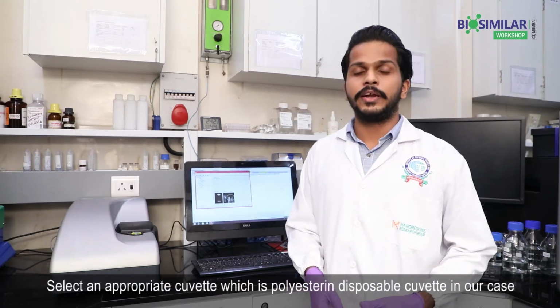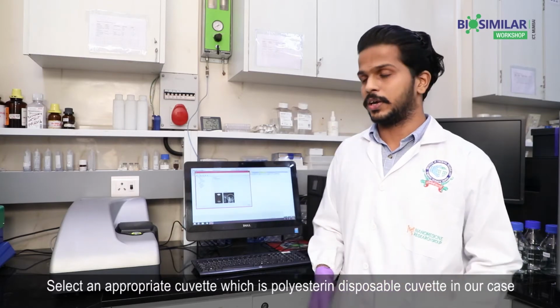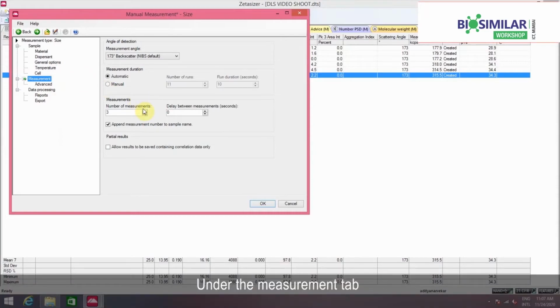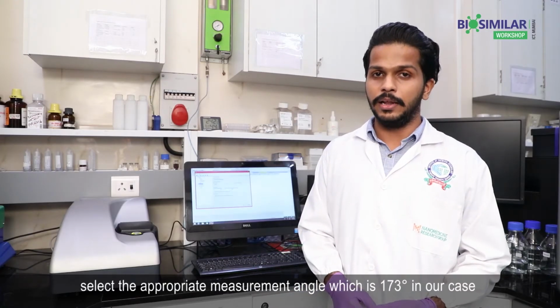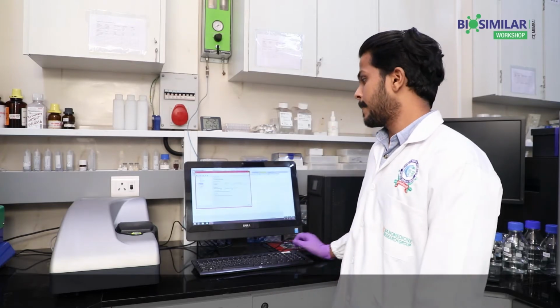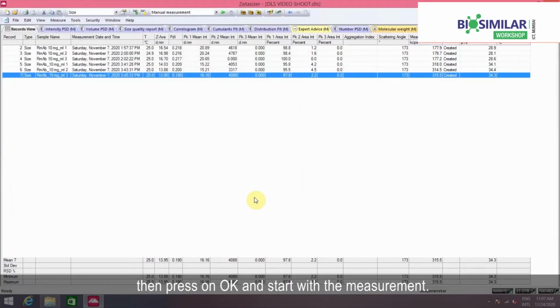Select an appropriate cuvette, which is a polystyrene disposable cuvette in our case. Under the measurement tab, select the appropriate measurement angle, which is 173 degrees in our case. Set the number of measurements to 3 so that we can take an average of the 3 measurements. Then press OK and start the measurement.